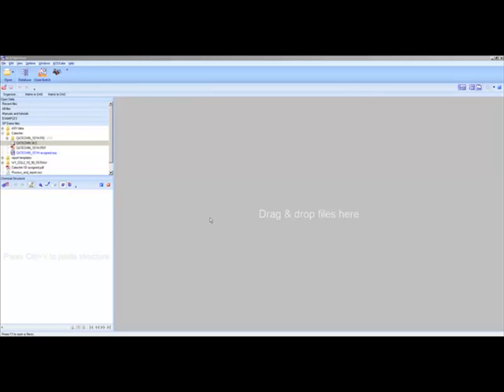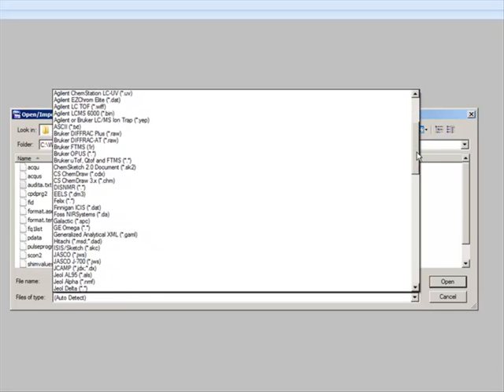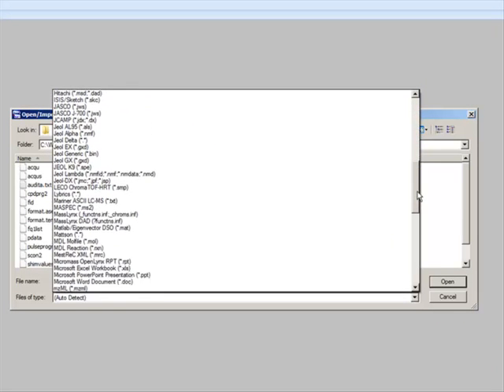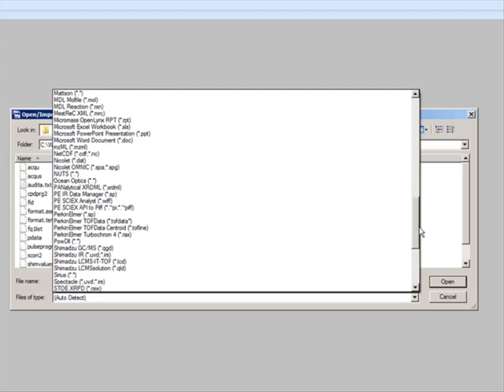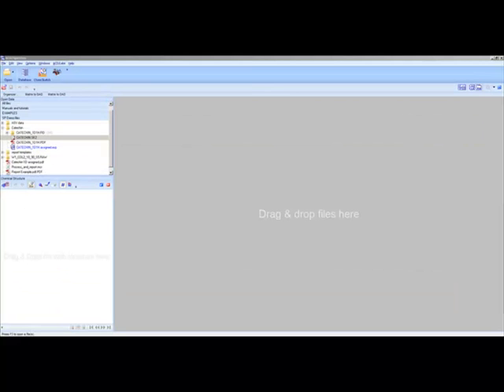Spectrus Processor is ACD Labs' gateway program that allows processing of all analytical tools commonly used in organic chemistry, including NMR, MS, DSC, TGA, UV-IR, HPLC, and XRD. We are vendor neutral and support file formats from Agilent, Bruker, JEOL, PerkinElmer, Shimadzu, Varian, Waters, and Xcalibur, just to name a few. But any software capable of processing such a variety of techniques must be complicated to use, right? Well, this is not the case with Spectrus Processor.